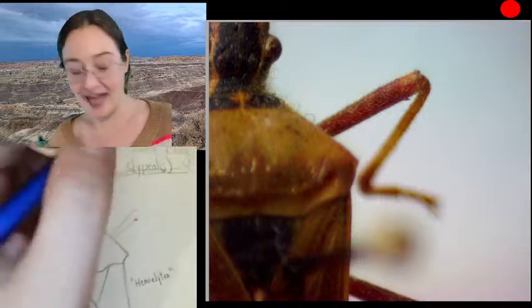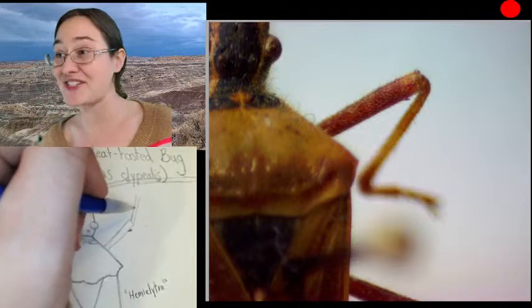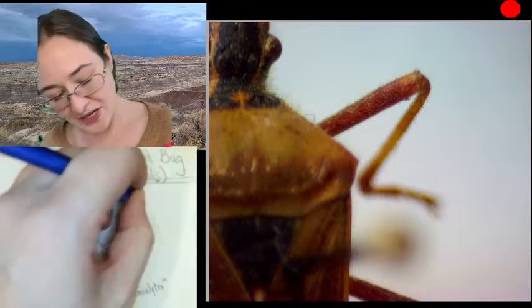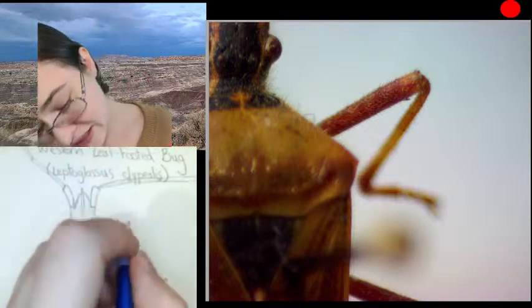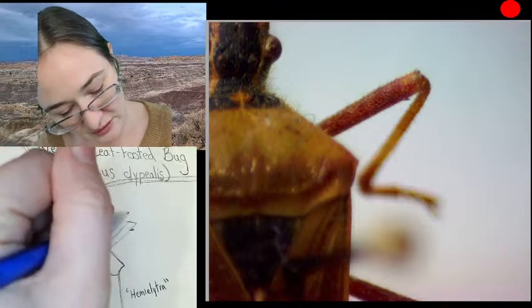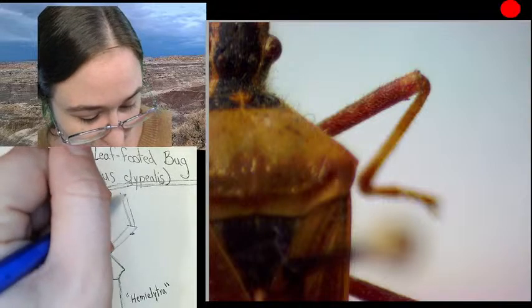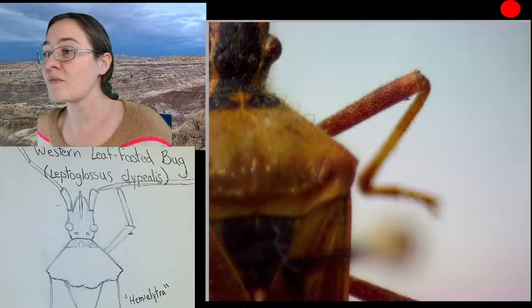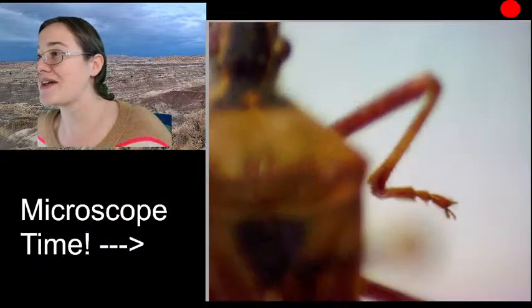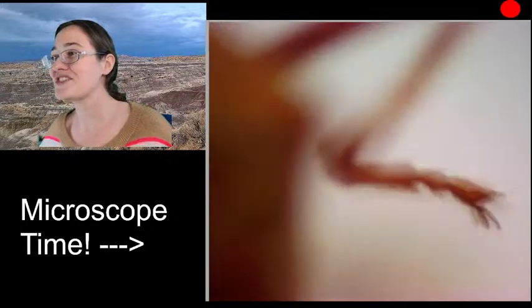Now, we're going to get our tibia up here. Let's see. I'm really excited about seeing those hind legs. Maybe I do want to move it down. I'm trying to figure out in which direction I want this tibia to be. You know what? I'm going to do it this way. Yeah. So I've got a tibia, and we're just going to go underneath the antenna. That's just what's going to happen. And I'm going to zoom in a little better so that when I'm sketching the toes, I can make sure that I get all the little stuff. That's what's cool about sketching with a microscope. You can just zoom in as far as you want.